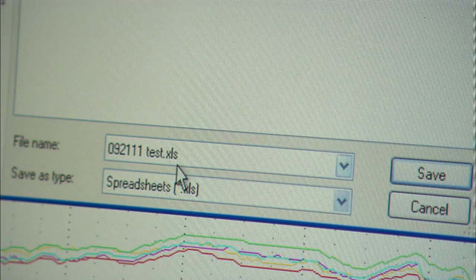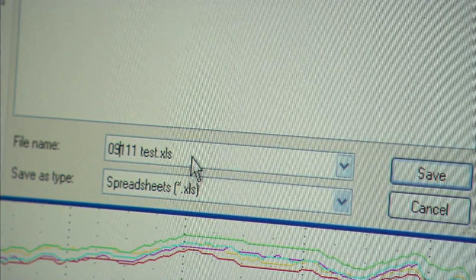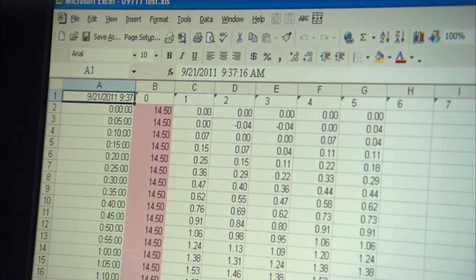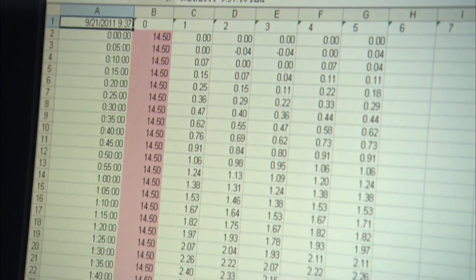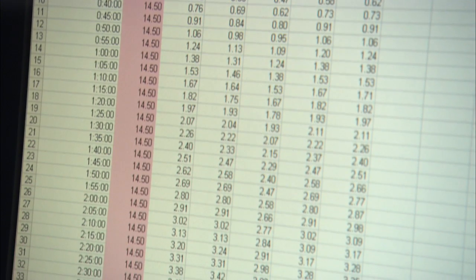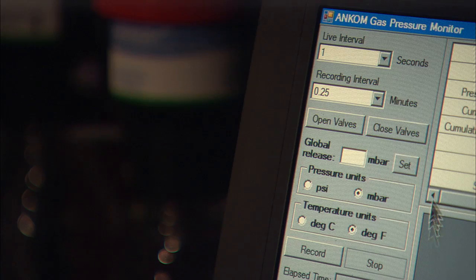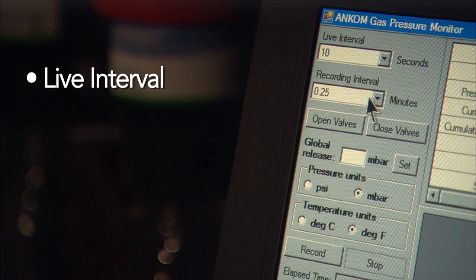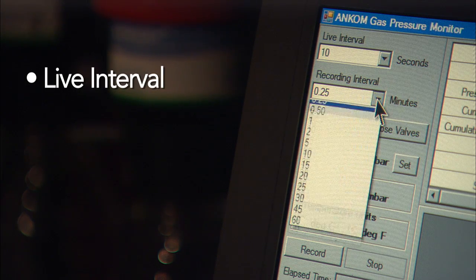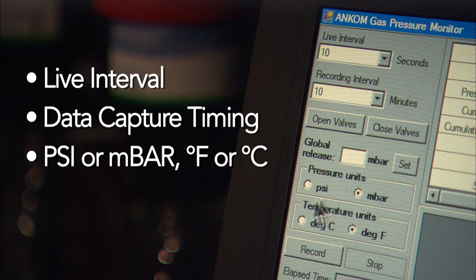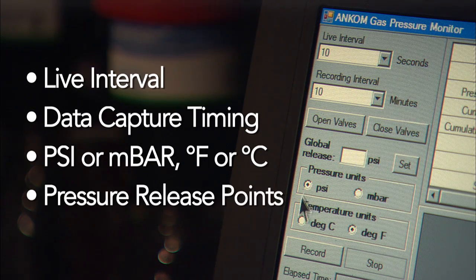At the end of the process, all data points are captured on a standard Microsoft Excel spreadsheet for analysis. The volume of gas produced can be calculated based on cumulative pressure. The custom-designed software and advanced electronics allow the user to control a number of variables: the time intervals of computer communications, the timing of data capture, the pressure and temperature units of measure, individual or global pressure release points, and more.